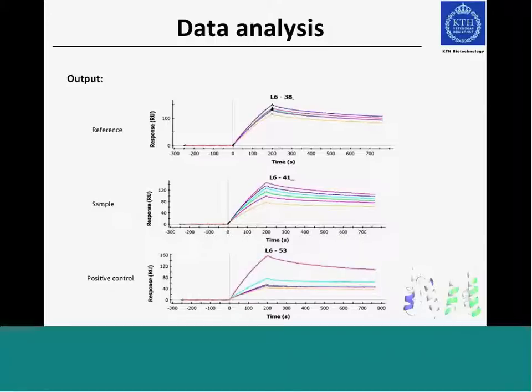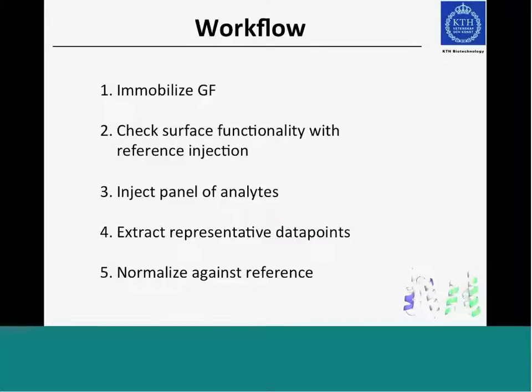So the workflow is immobilization. You have to check the surface functionality with reference injection. Then you inject your panel of analytes, and this is quite time-consuming here because, as I said, it's a pre-incubation. So we actually did 1 hour pre-incubation, which is quite long.